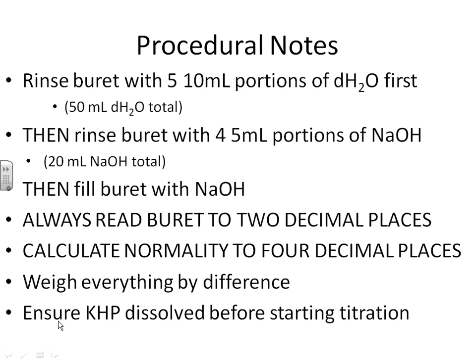Everything in this lab has to be weighed by difference because slight masses that get stuck on weigh papers and aren't transferred into the flask are going to make a difference. Additionally, KHP is a solid. It's not a liquid, and you're going to be dissolving it in water, in boiled distilled water, by the way, not just regular old tap water. Good God, no.